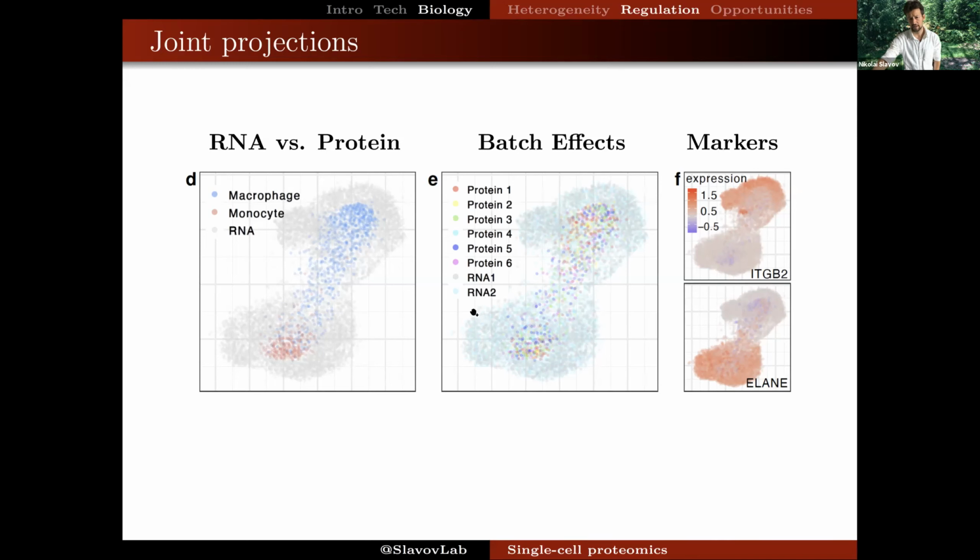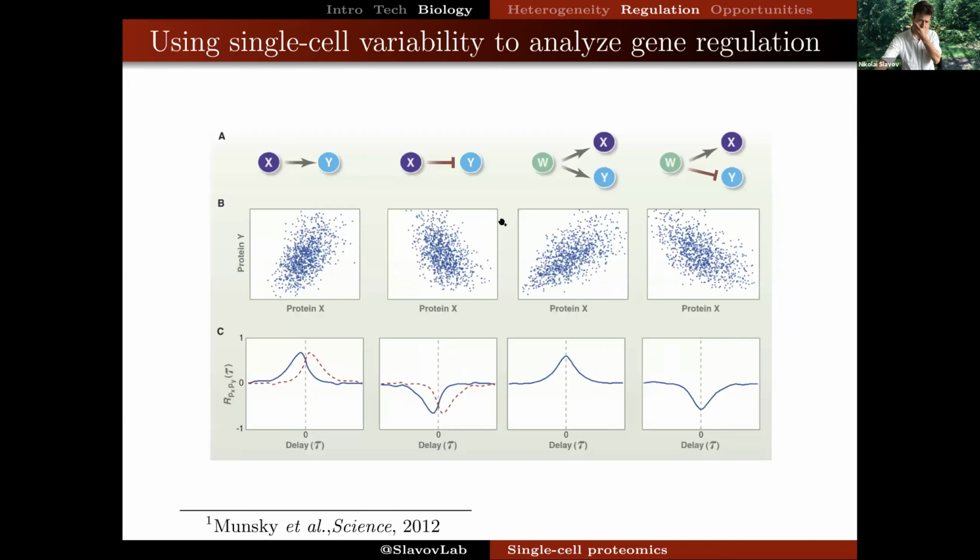And here we also tested for possible batch effects remaining due to different biological and technical batches of sample preparation, digestion, and so on. And we see that they don't account for much of the variance that is left in the data. Those have been successfully managed and controlled.